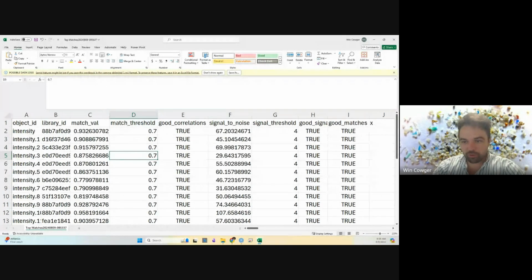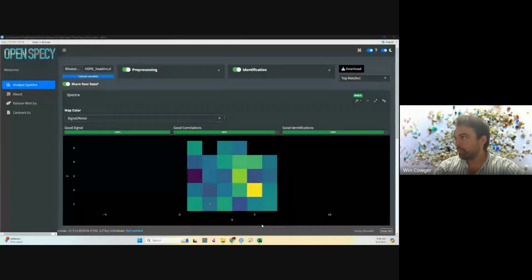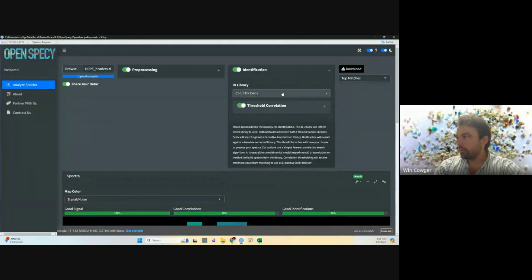Okay, used a different library, FTIR derivative, and did not get the same library type. Interesting. Let's see, FTIR derivative. And thank you for the questions. I'm not totally sure what you're asking, Julian. Maybe you could rephrase it.